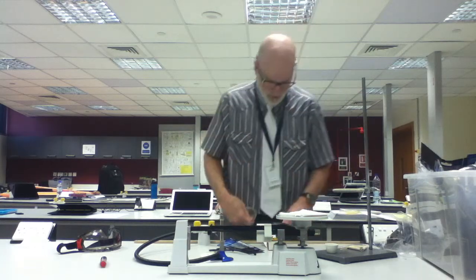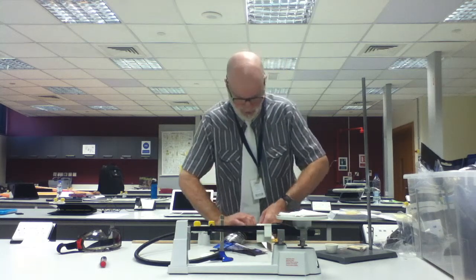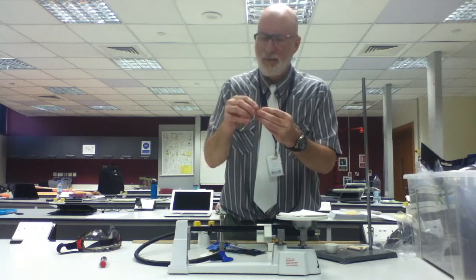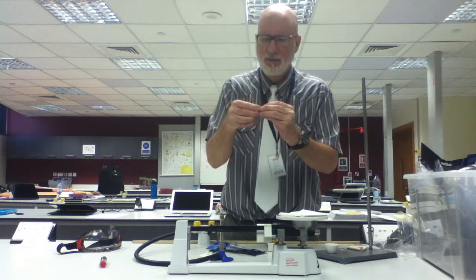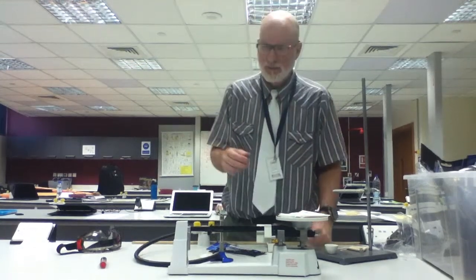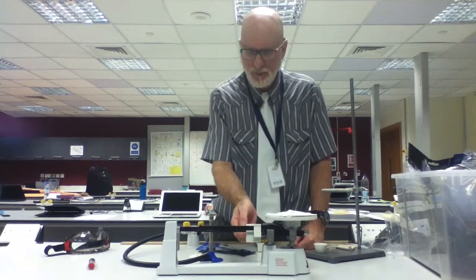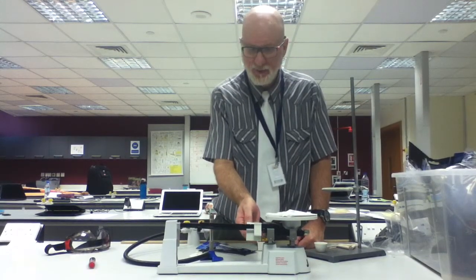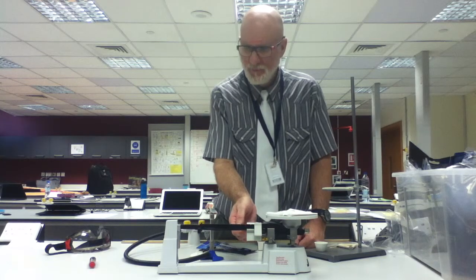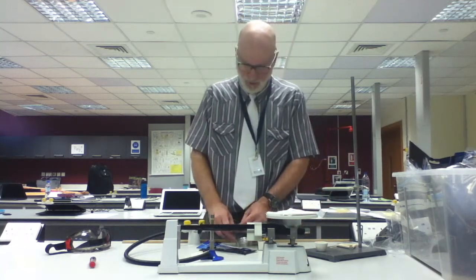Then you take 5 centimeters of this. About 5 centimeters. It doesn't have to be exact. Roll that up like this and put that there. Now find the new mass, the total mass. Actually, not enough. You're going to have to put even more on there because it's just not registering.